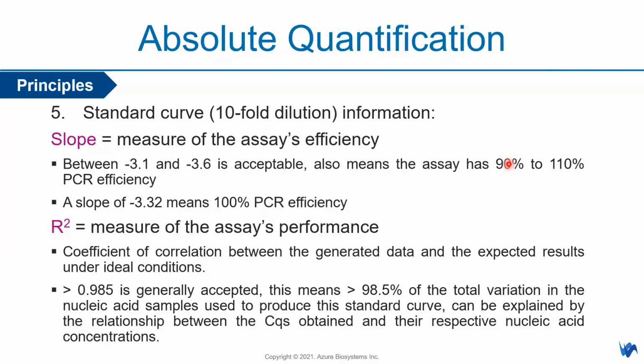Sometimes you have lower, sometimes you have higher qPCR efficiencies. These are heavily influenced by either your sample, or primer, or even the reaction mixture that you use. So this is something that you need to troubleshoot and try before you run it on your unknown samples. Right. Slope. Next, we go to R square value.